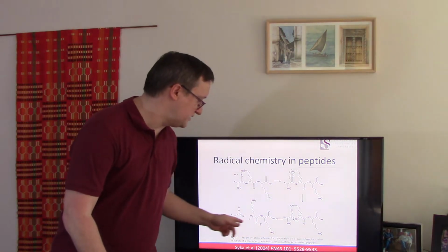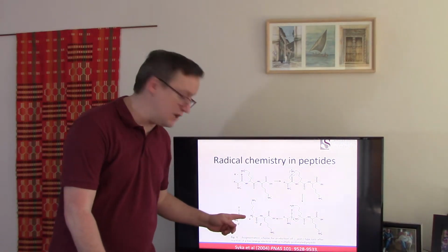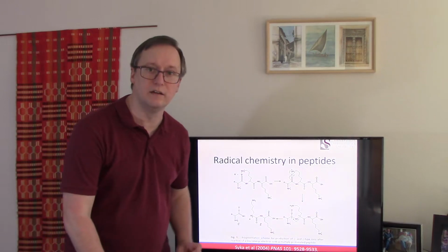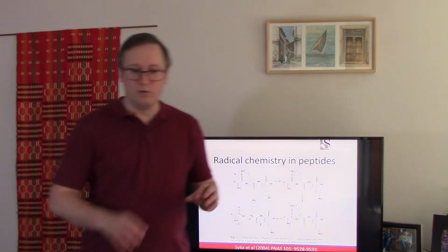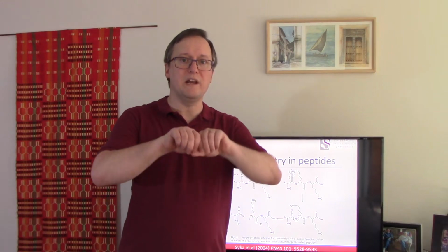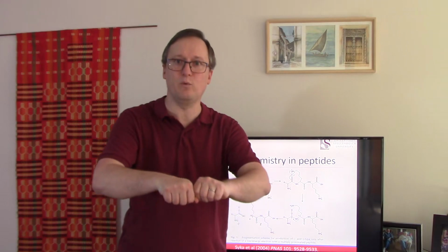The structure for this breakage between an N and its alpha carbon and inside the amino acid creates what's called a C ion and a Z ion. And one of those is a radical as well to reflect the mismatch in number of electrons. So what we've produced then is a relatively gentle way to break apart a multiply positively charged ion, dropping its charge by one, and breaking it between the N and C of a particular amino acid.